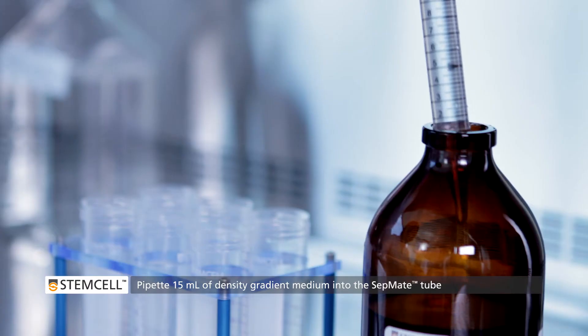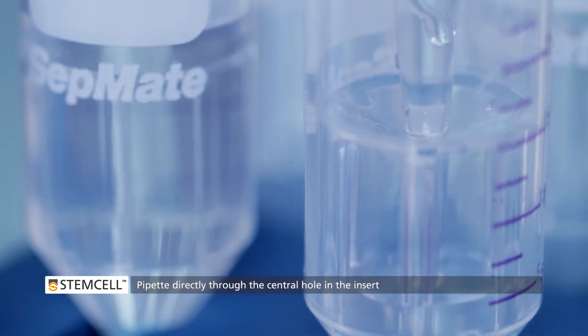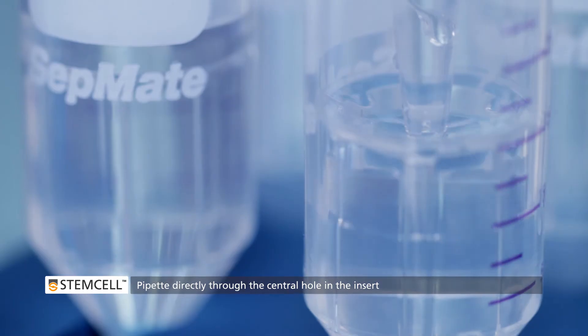Start by smoothly pipetting 15 mL of Density Gradient Medium into the SEPMATE tube through the central hole in the insert. Bubbles may be present in the medium, but this will not affect performance.